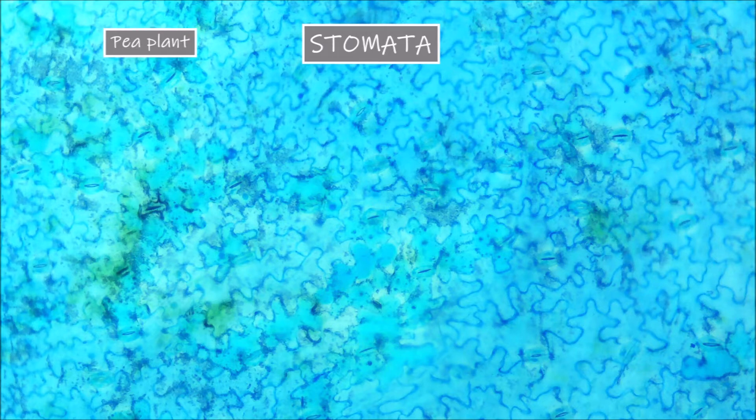The first type of leaf we are looking at is that of the pea plant, as an example of what stomata look like in dicotyledon plants. Stomata are mostly found on the bottom surface of the leaf, so this sample we are looking at is a peel of the outer layer of epidermal cells from the bottom surface of the leaf. Here on the lowest magnification you can see a whole bunch of small oval shaped structures on the surface of the leaf.